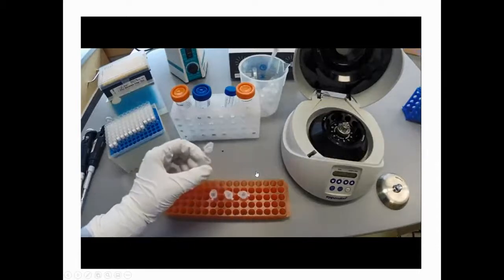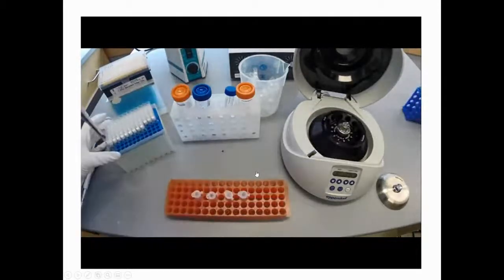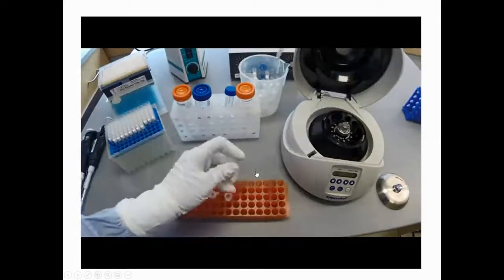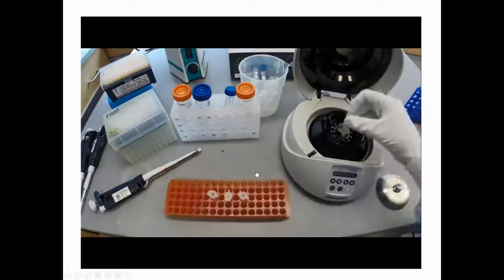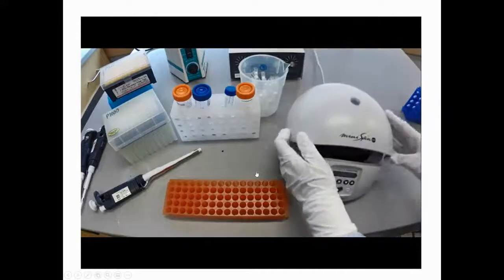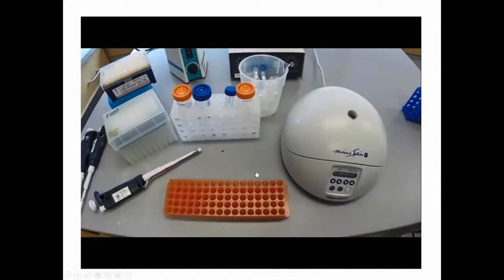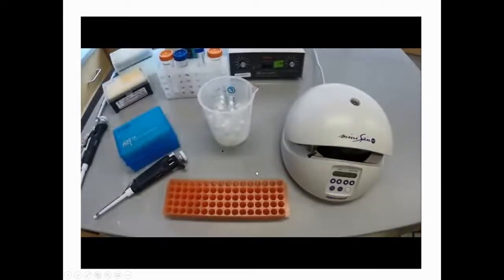Do not mix the solution, as it is imperative that the pellet is not disturbed. Repeat this process for all remaining samples. Place the samples in the centrifuge, being mindful of balance, and spin for 2 minutes. Remove the tubes from the centrifuge carefully.